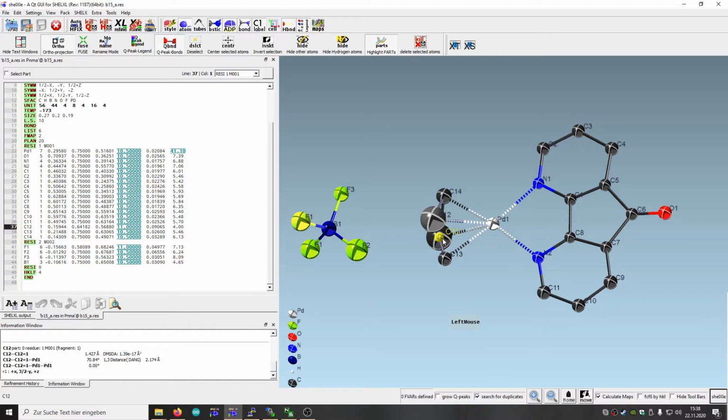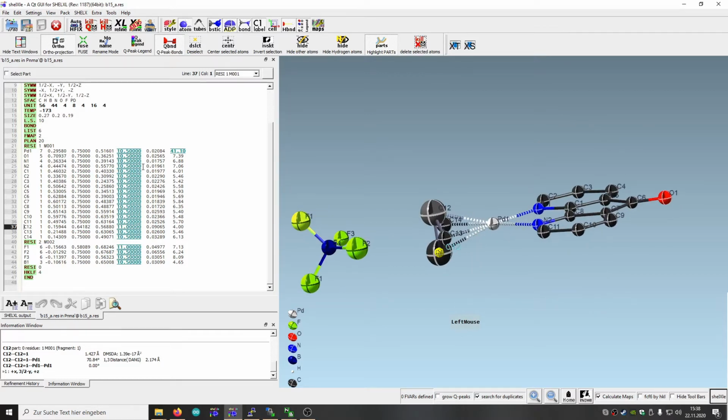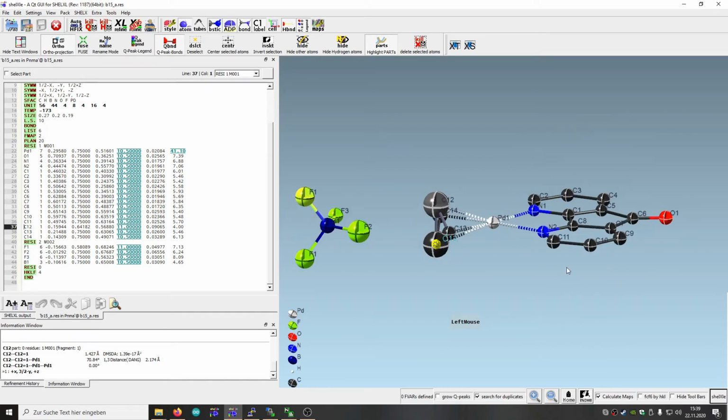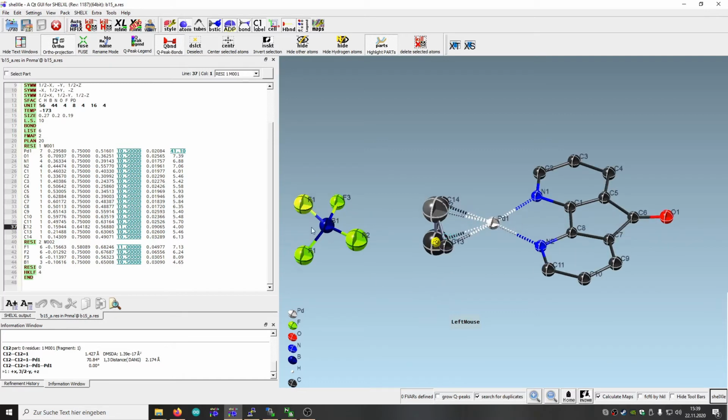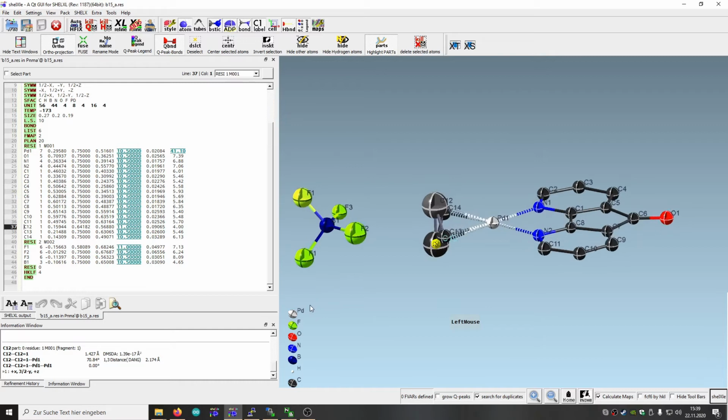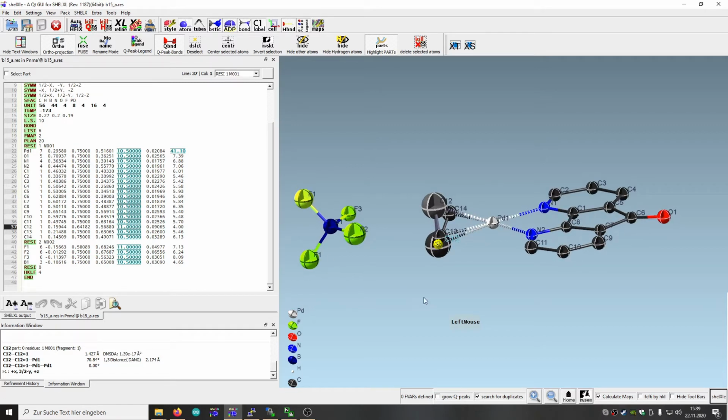So we have here C number 12 fully occupied, and as we see here with 10.5 means half occupied, most of the atoms are on a special position, so it's on a mirror plane, and the same is for this BF4 anion, so where we have most of the atoms are in the plane, and just fluorine 1 here is out of the plane and has a symmetry equivalent over here.